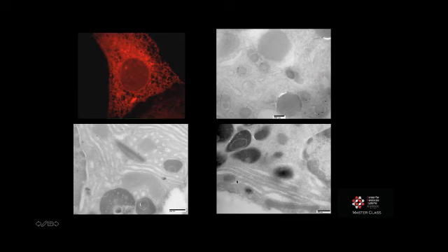Finally, in this last picture, we see that the lamellar ER stacks are heavily labeled, but if you look closely, it's actually the luminal side of the membrane that is being labeled. So all 3 of these different labeling results could ultimately have looked like this by confocal. So that's another reason that you can consider doing immuno-EM.